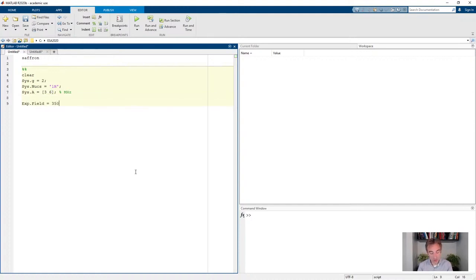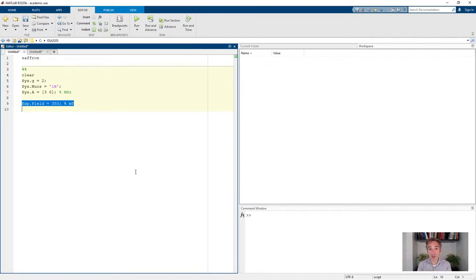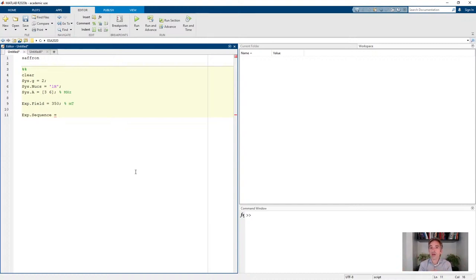Let's set the field at 350 millitesla. Remember that pulse EPR spectra are performed at fixed field, so we don't specify a field range to sweep — we just specify a fixed field using exp.field. For the pulse sequence we use exp.sequence, and one of the simplest is the two-pulse echo where we increment the tau values, leading to an echo decay and, if nuclei are hyperfine coupled, a modulation of the echo decay. This is a predefined pulse sequence in EasySpin specified as '2pESEEM' in the exp.sequence field.